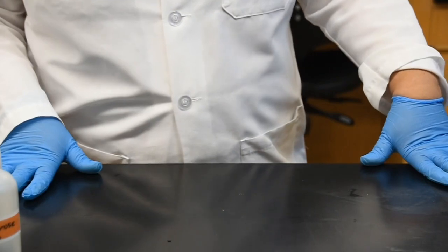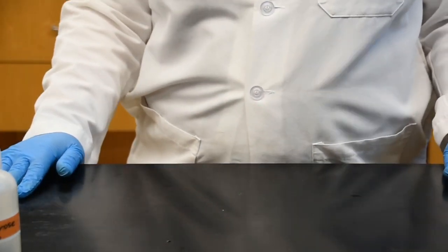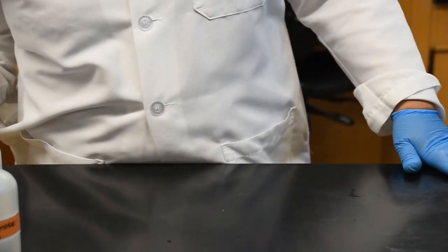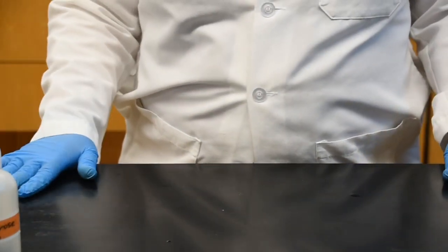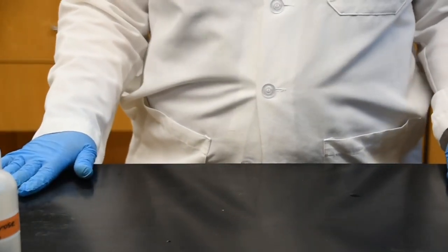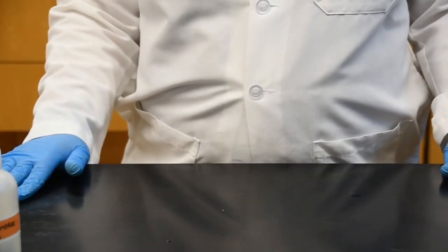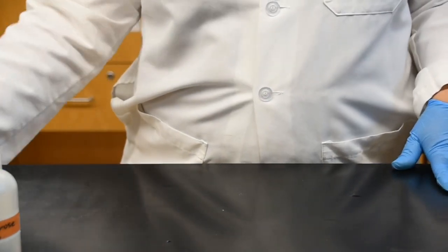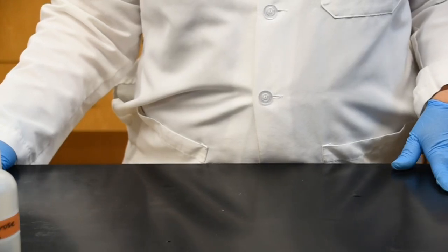The next experiment we're going to do is using the concept of osmotic pressure. Again, if you are unfamiliar with that, please review the background information I have provided for you. The basic idea behind osmotic pressure is the pull your solute molecules have on your water. The more solutes you have in a location, the more water wants to move in that direction.